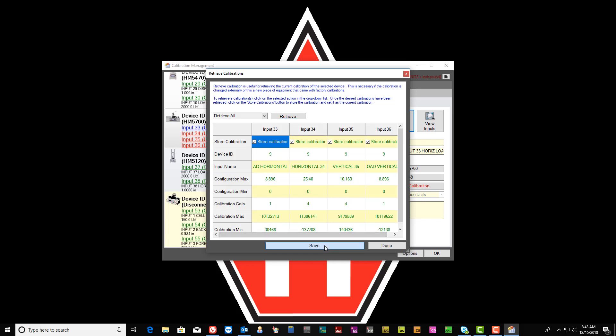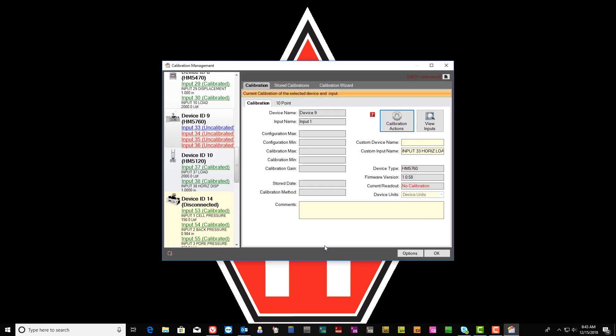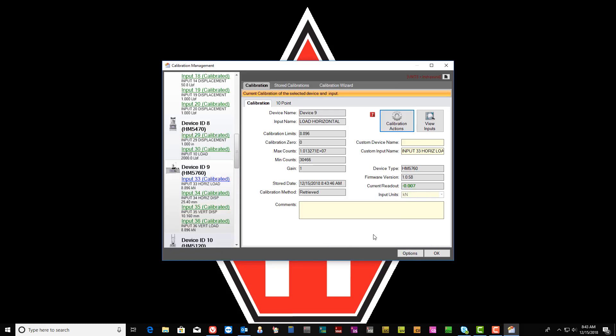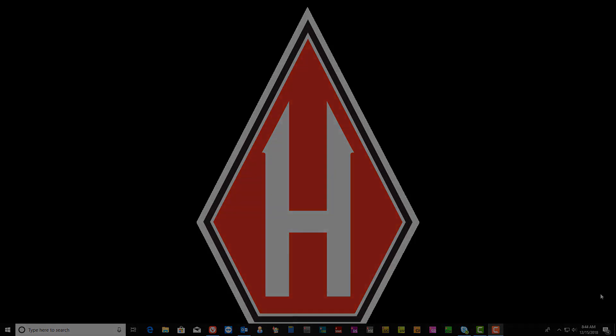And then select Save. From there, select the OK button. And that's how you import calibration data into HMTS Next.